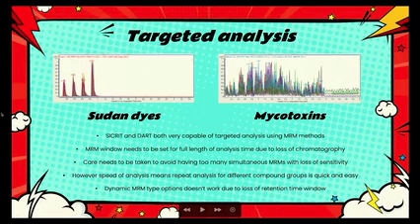It gets very upset, very confused when you start having the same ions coming out at 5 seconds and 10 seconds and 20 seconds and 40 seconds, which creates the challenges. And that's really behind this workshop.